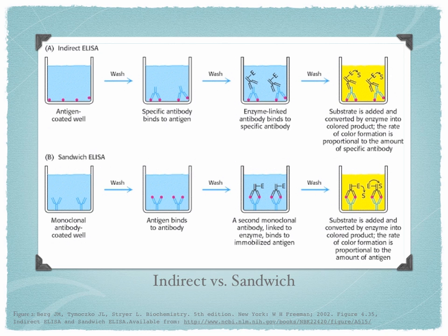Now look at the second row. Sandwich ELISA coats antibodies in the well, and it is washed. Antigen is added, which will bind to the antibody. Wash, and then add a specific antibody with an enzyme. There is a final wash, and then again the substrate plus the presence of enzyme will change the color and detect the presence of antigen. Competitive ELISA detects if a complex is present by adding a serum that may have an antigen-antibody complex or an antibody alone that it can attach to the antigens.